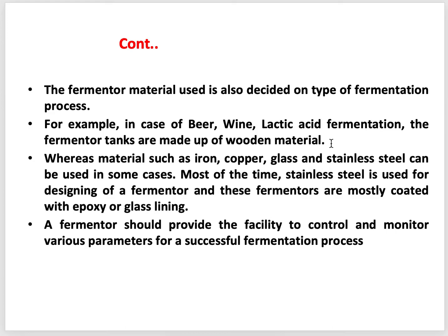However, traditional brewing is costly. So the industries that produce alcoholic beverages in mass amounts don't use wood as fermenter material. They prefer to use stainless steel.